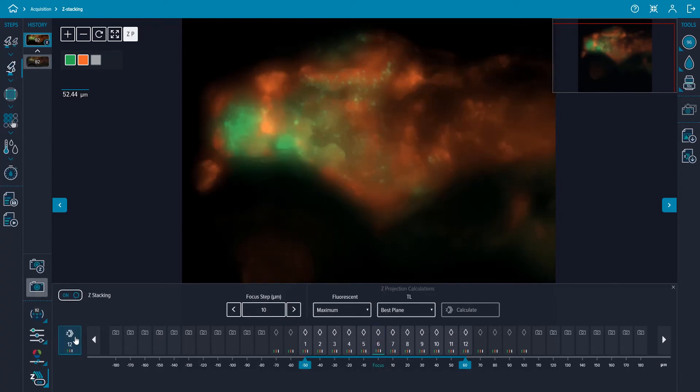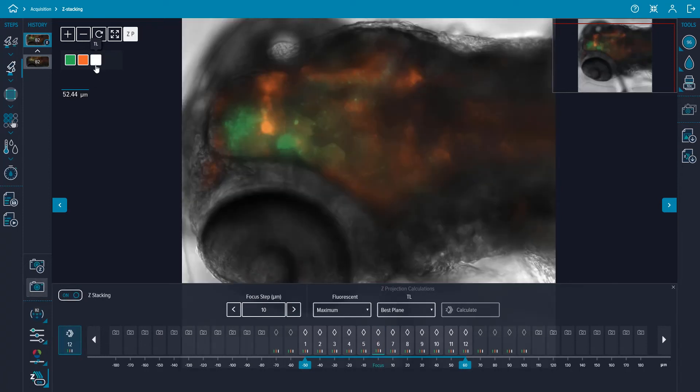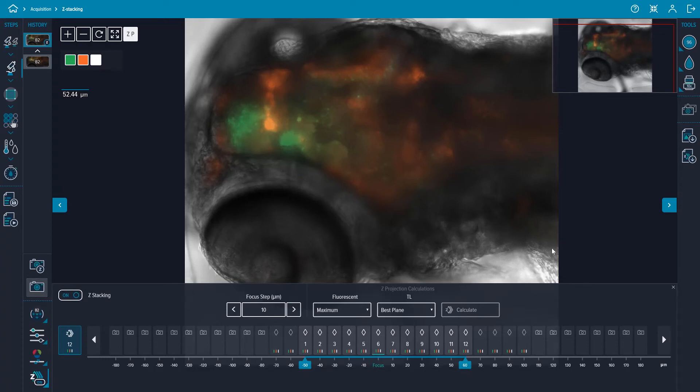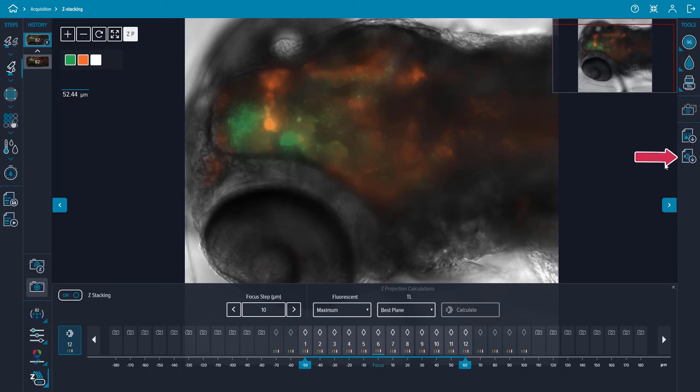If desired, the TIF images for every plane in the z-stack can be exported along with the z-stack projection for the individual well that is in the current preview. Ensure that the z-stack projection button is highlighted and then click on the download z-stacking images icon on the right hand side of the window.